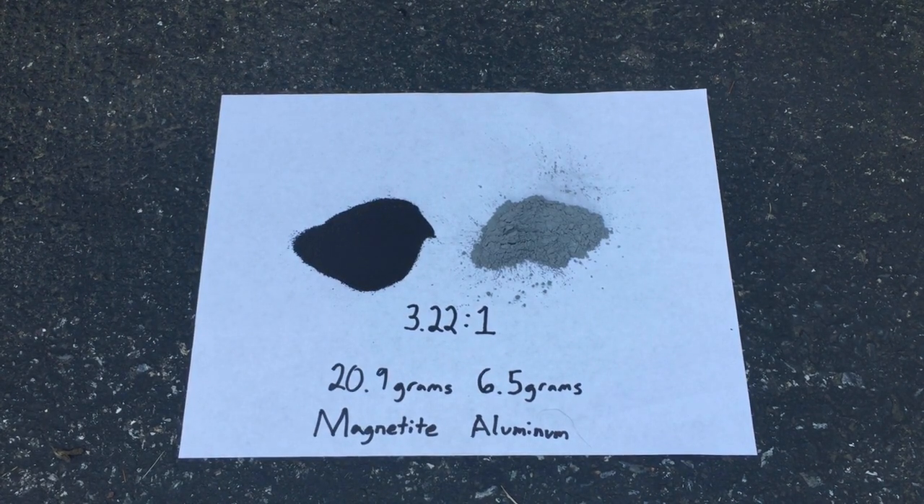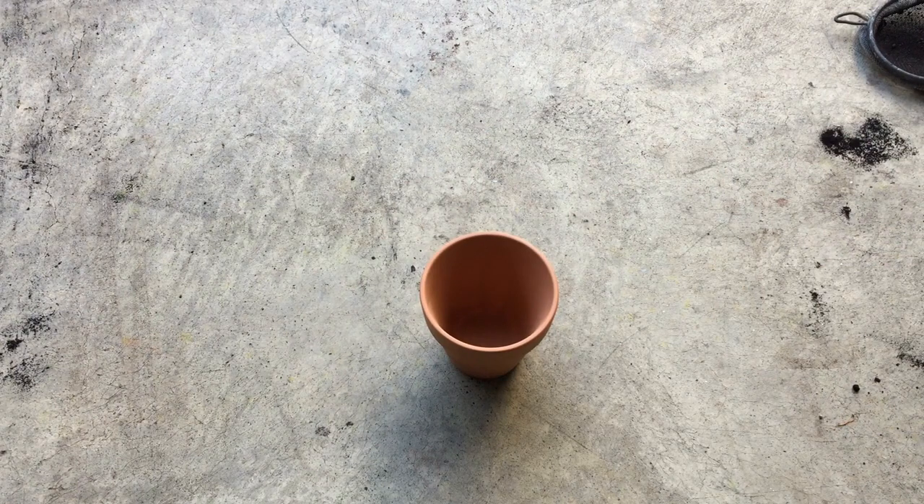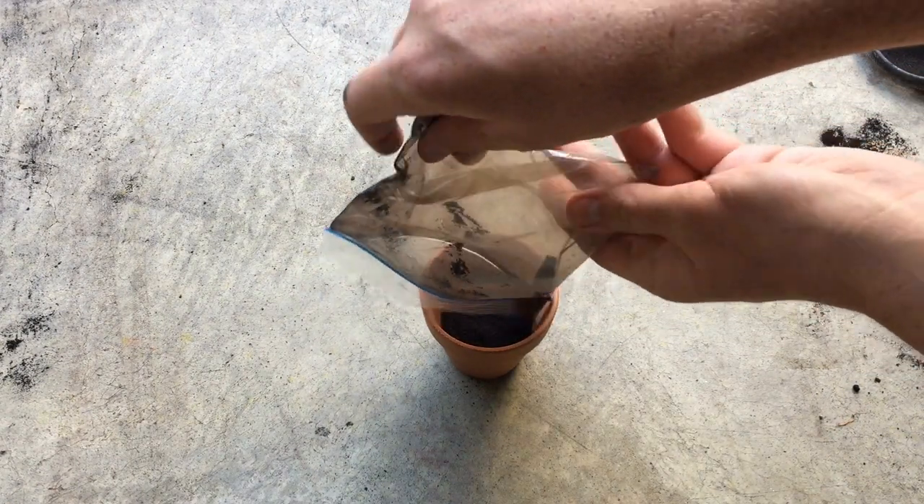With both our magnetite and aluminum powder on hand we can make the mixture with the ratio 3.22 to 1 magnetite to aluminum powder, which will be our thermite. Since I want to collect any iron produced in the thermite reaction, I will be doing it inside of a terracotta pot vessel.